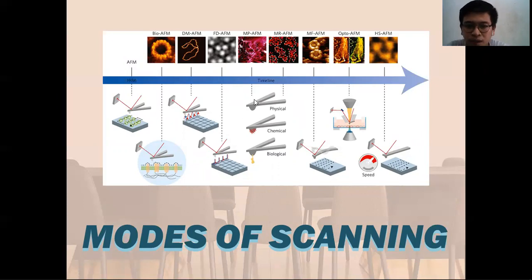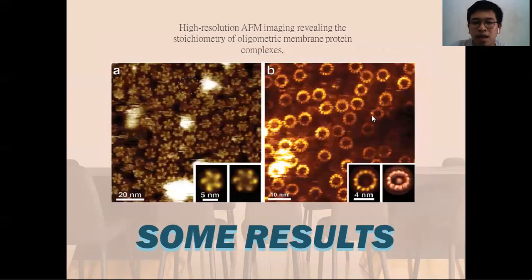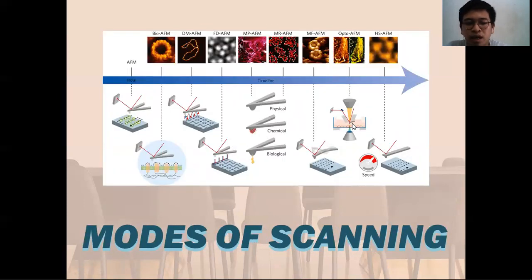Second is the non-contact mode, which has signal-to-noise benefits associated with modulated signals as it has a weak attractive force, and these oscillating modes measure images with a small probe-sample force only. Then lastly is the tapping mode, which has no capillary effect. Its amplitude signals are used in feedback, and this mode is usually used for air imaging.